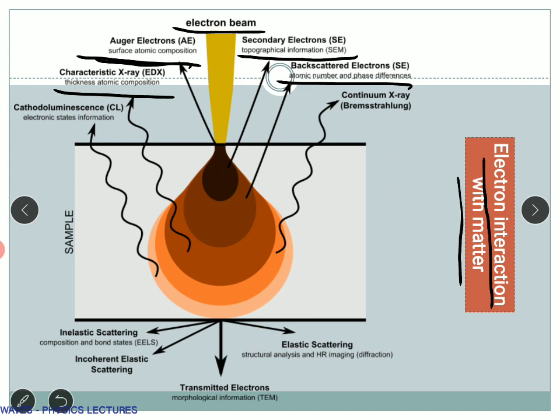We have talked about Bremsstrahlung. Deep inside the system we also have the process of Bremsstrahlung. What happens is the electrons go and pass through the system, but the electron is negatively charged and the nucleus is positively charged, as a result of which the electron speed gets decelerated. Because of this deceleration some kind of X-ray is given out, which is nothing but Bremsstrahlung.